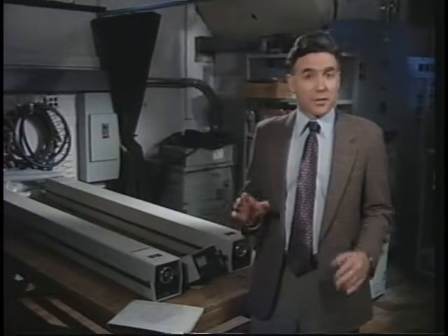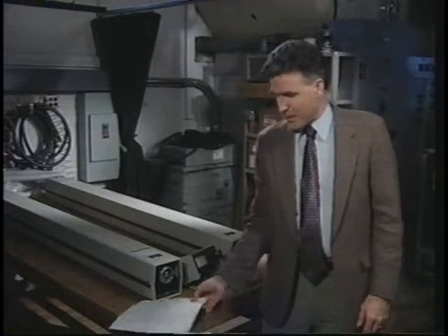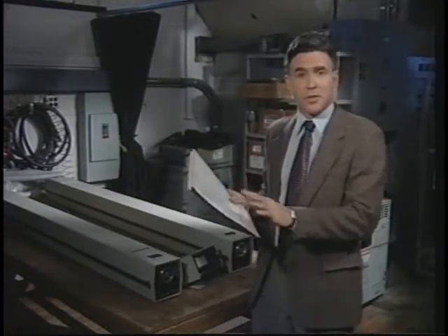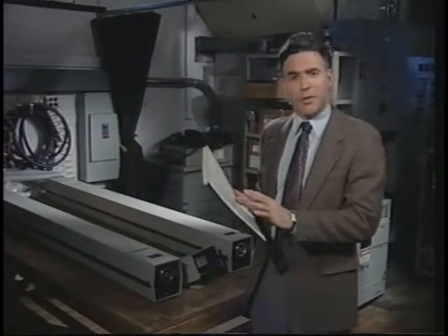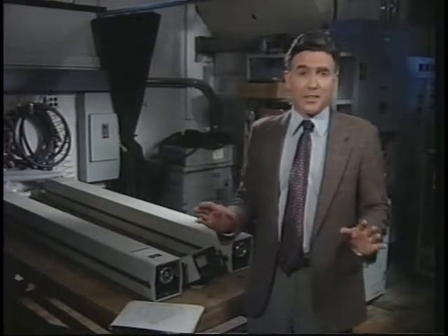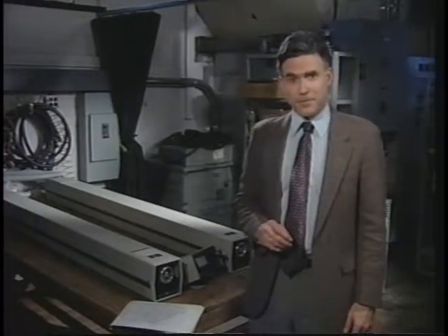The best way to prevent accidents is to be respectful around lasers. Regularly inspect lasers used in a manufacturing environment to verify that all their safety features are functioning. Read the instruction manual and standard operating procedure for each laser and follow all procedures as written. Don't take shortcuts. With lasers, accidents happen at the speed of light.